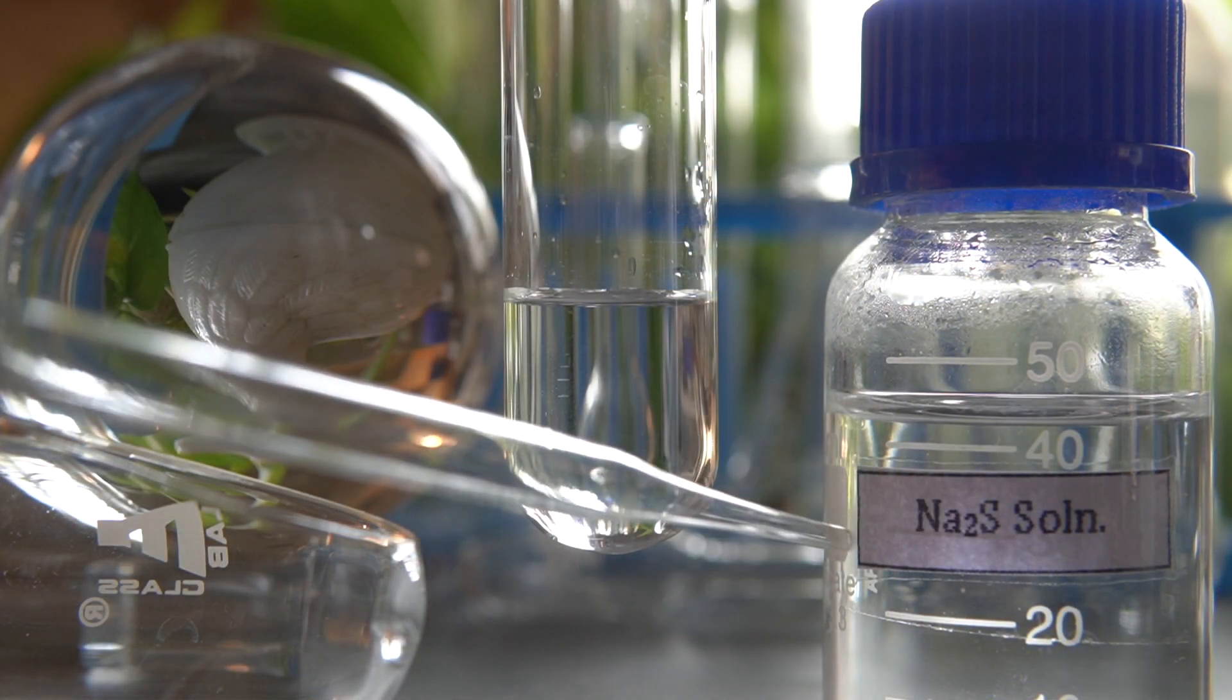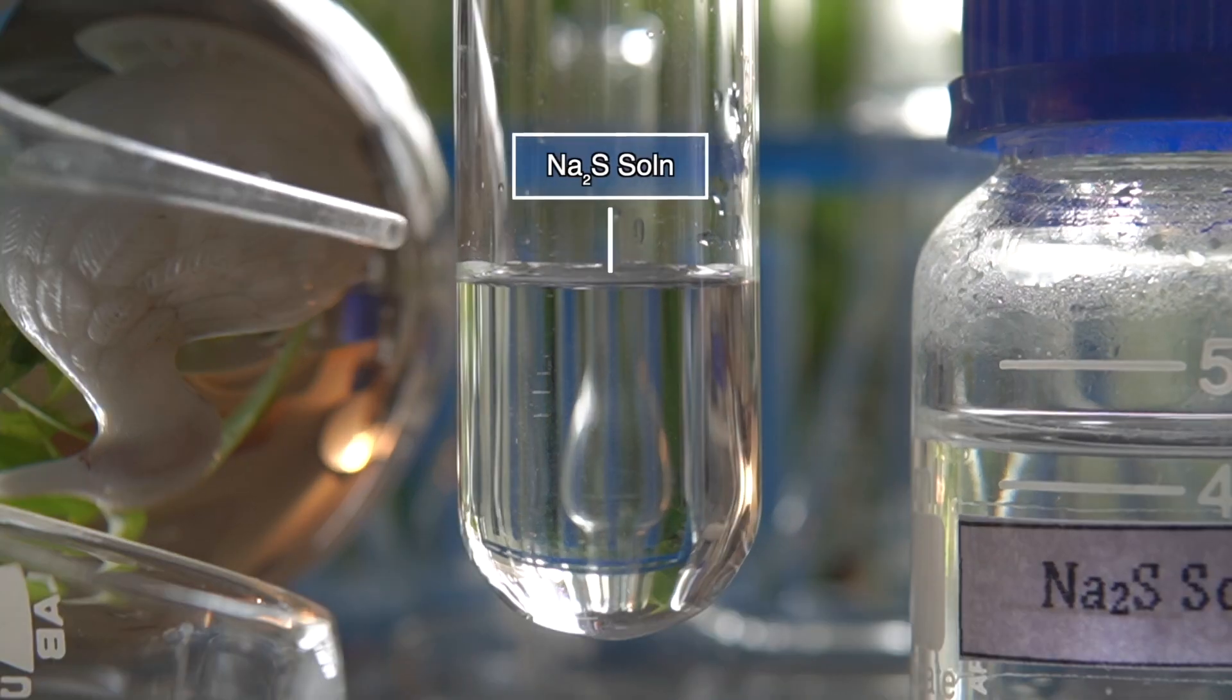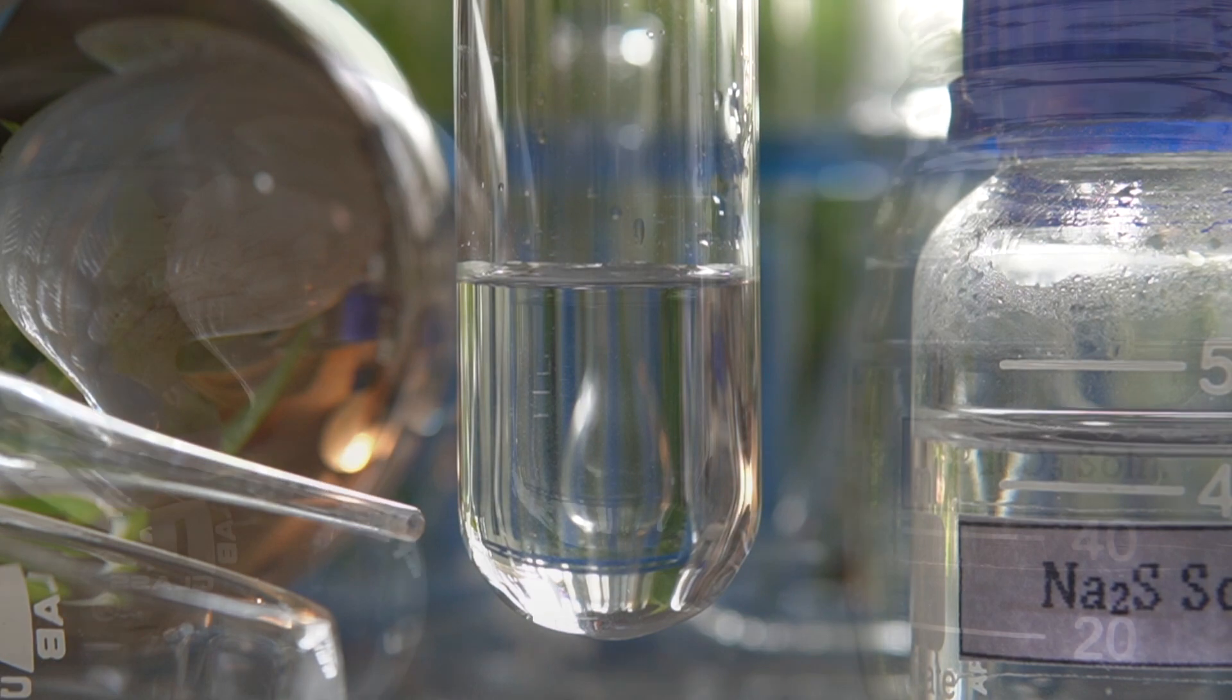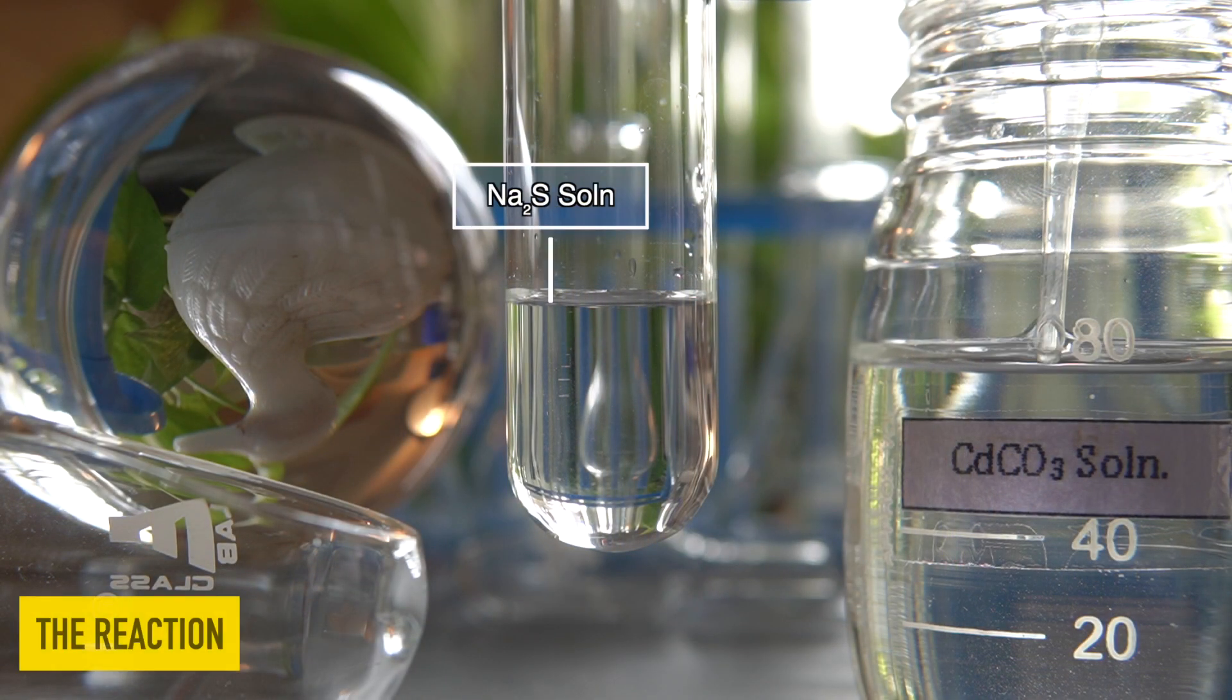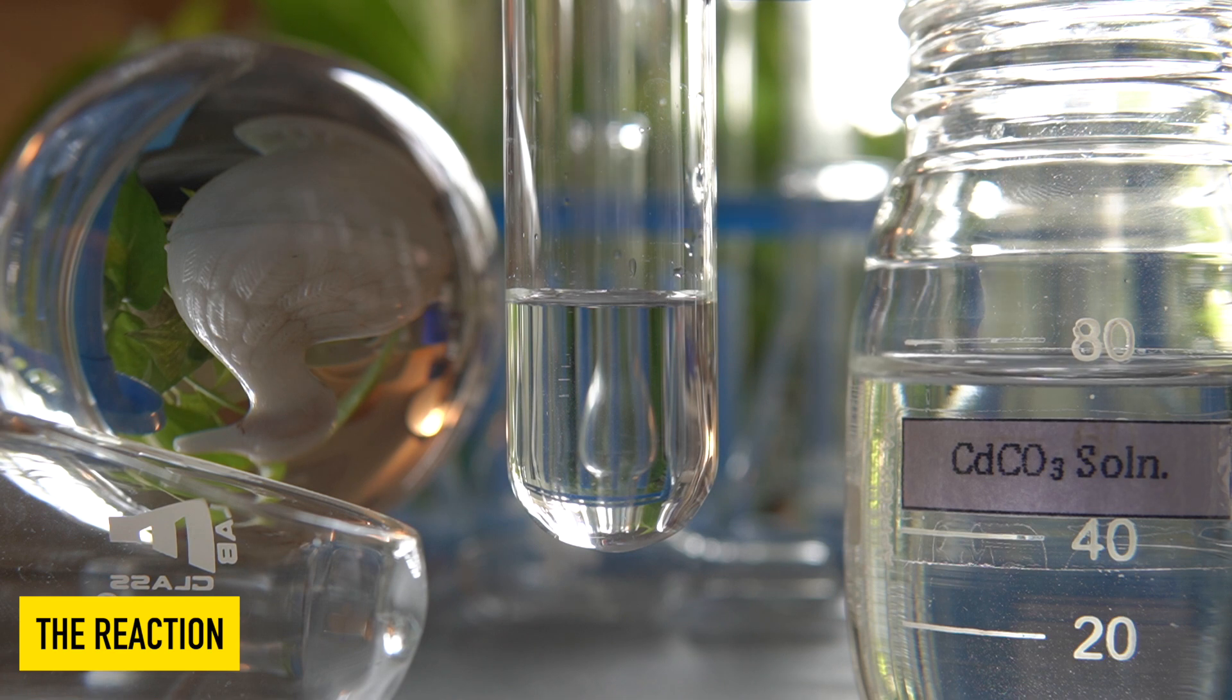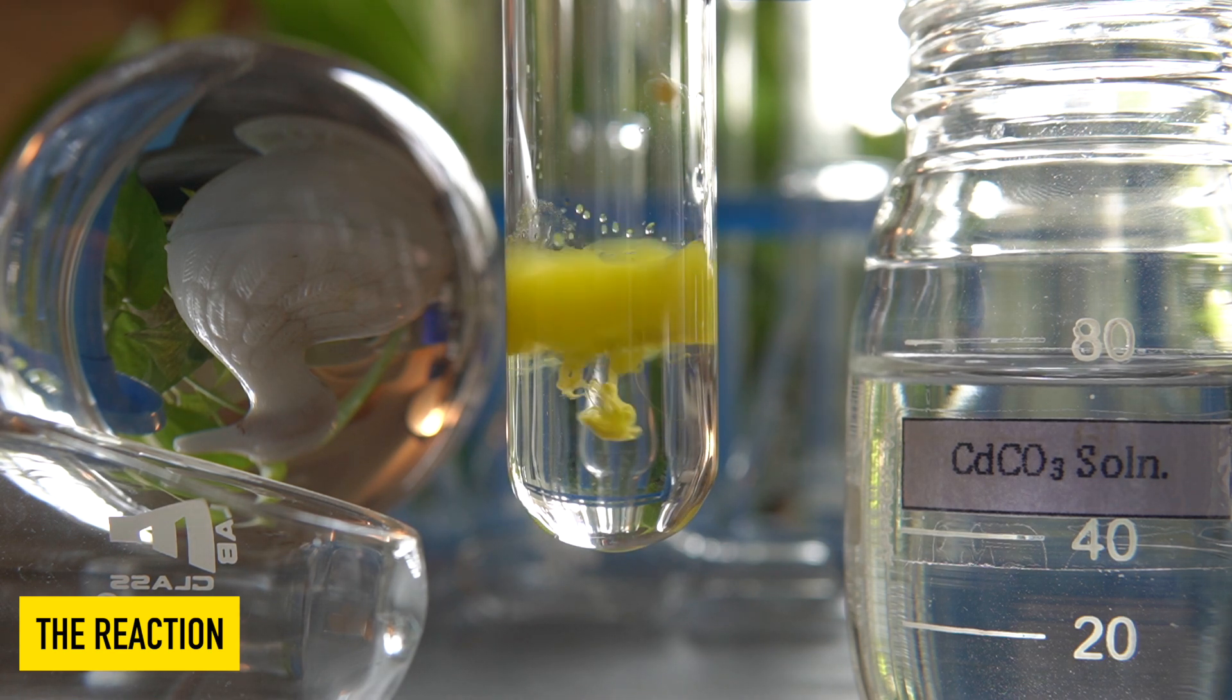Now to initiate the chemical reaction, we will take some amount of clear solution of sodium sulphide into this test tube. Now we will add the clear solution of cadmium carbonate into sodium sulphide dropwise and observe the effects.